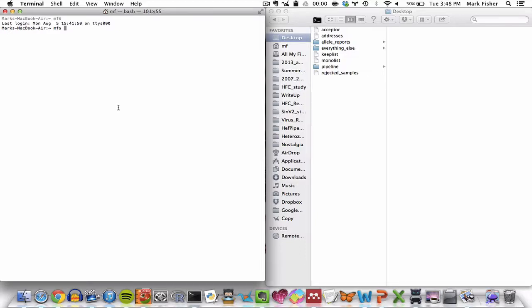Hello and welcome back to HethPype. This installment of the tutorial is designed to demonstrate how HethPype accommodates GeneMapper formatted files into the pipeline.